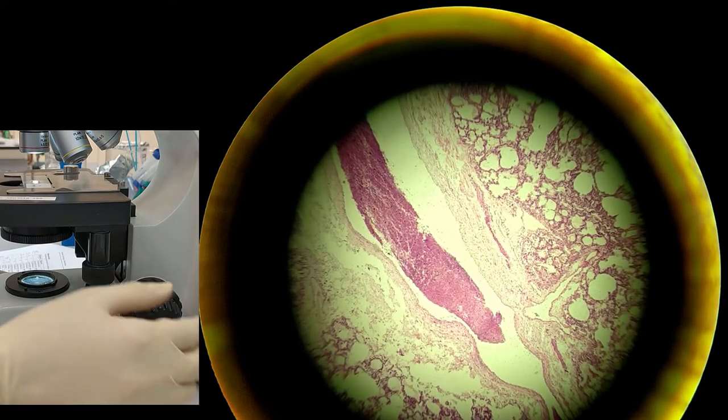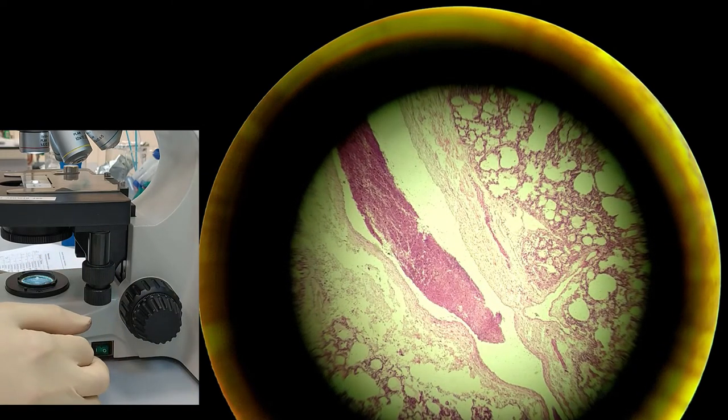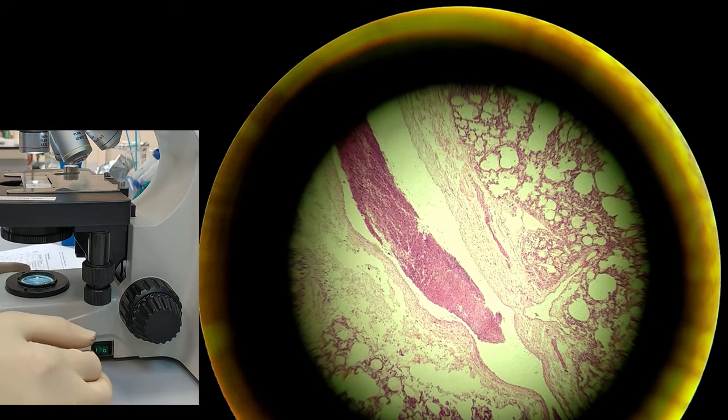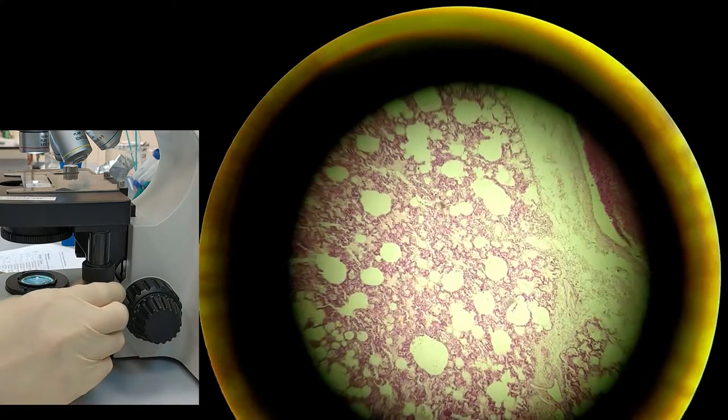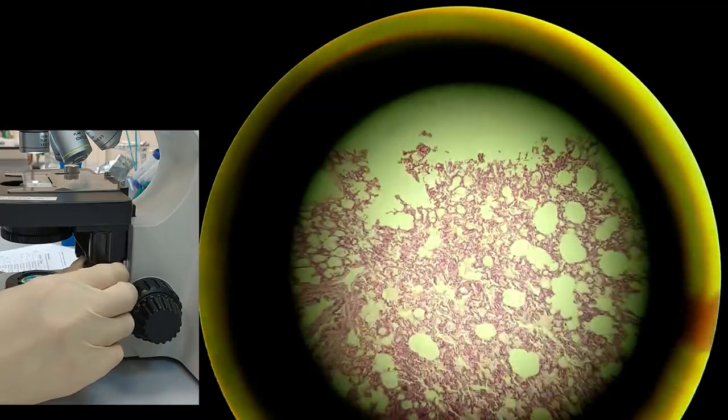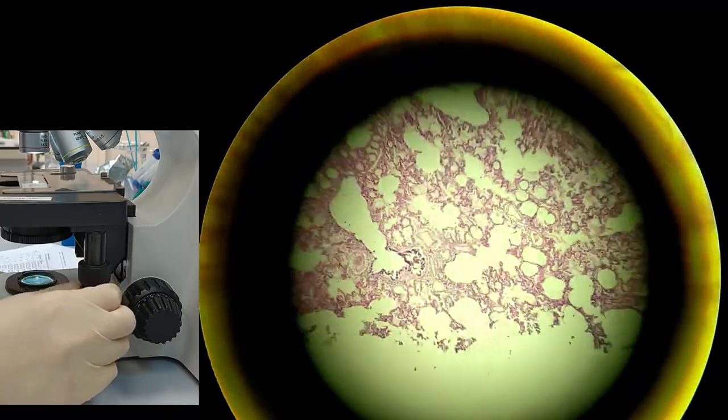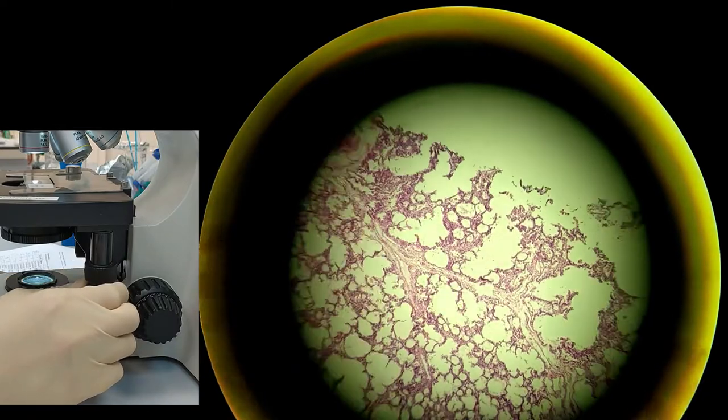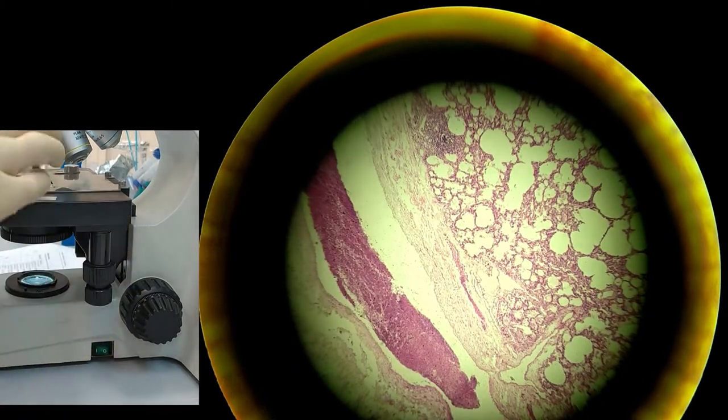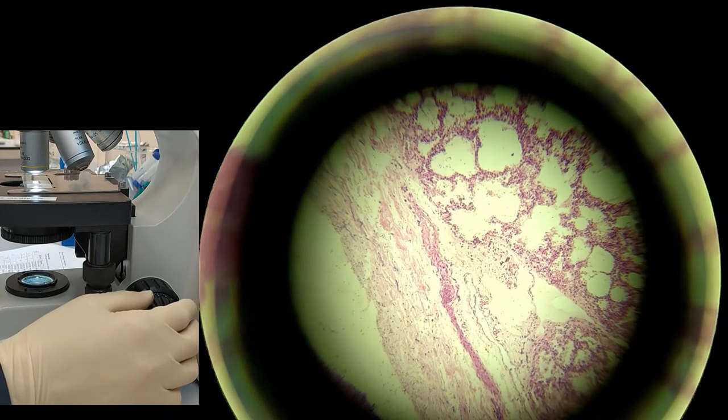So after you found it, this is the first slide and it is simple squamous epithelium, the lung epithelium. You can scan through it on the lower magnification, and if you found something then you can use bigger magnification like 10x or 40x. In this case, we are going to use 10x.